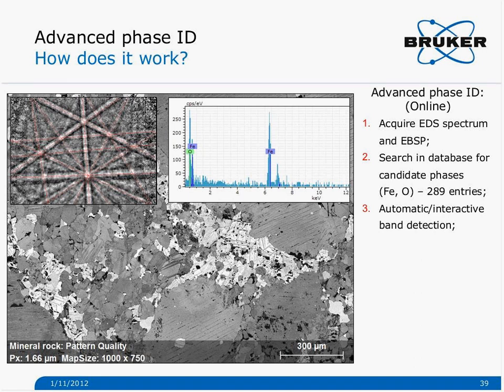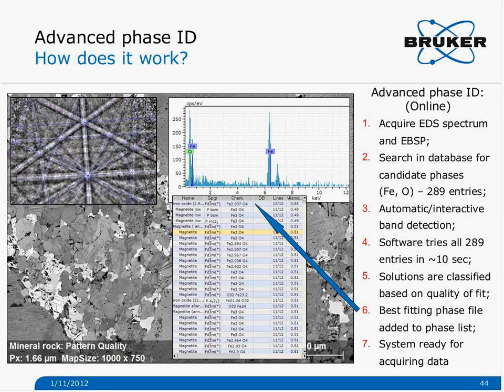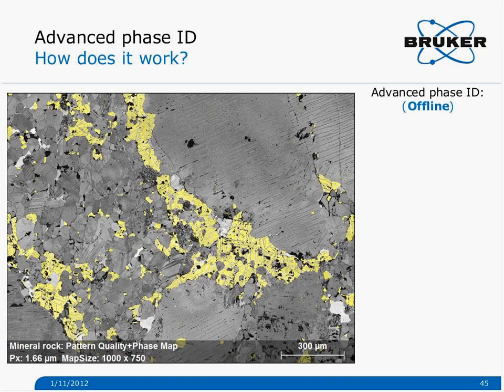Maybe Daniel would like to speak more from the materials science side. Yeah, I would say this is quite typical. For material scientists it would be a much easier job. We are spoiled to work with materials giving much better diffraction signal, or most samples in material science give much better diffraction signal than silicates, for example, for geologists or mineralogists.